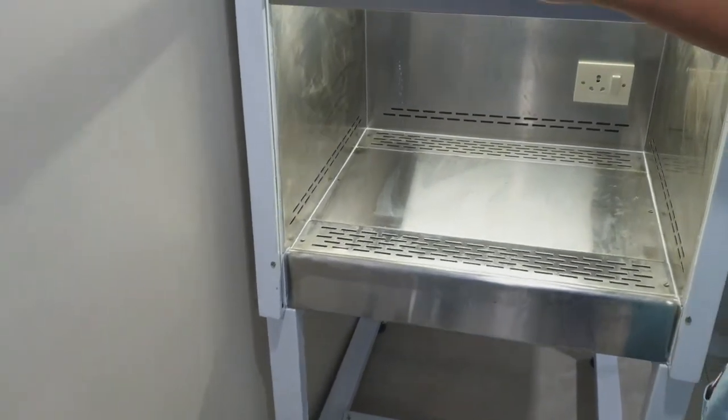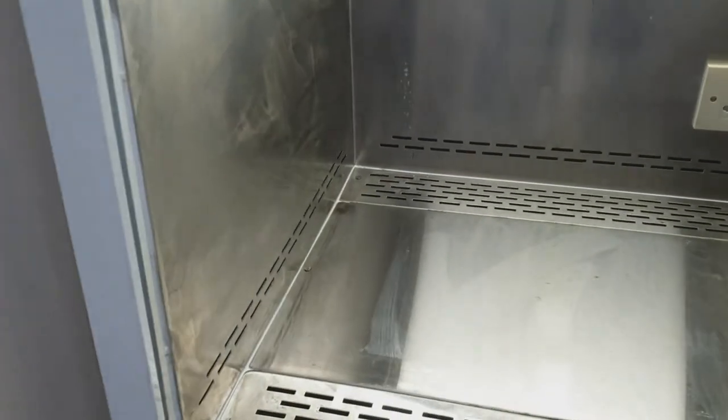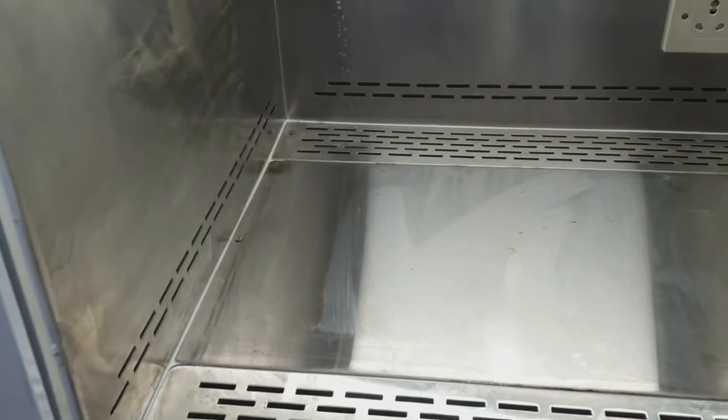This is the air filter which is on the top. If you see, there is a vertical airflow from the top to bottom. It is not a horizontal airflow from the left to right or right to left.